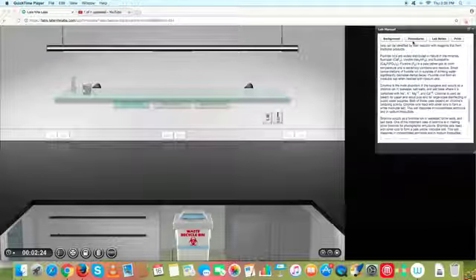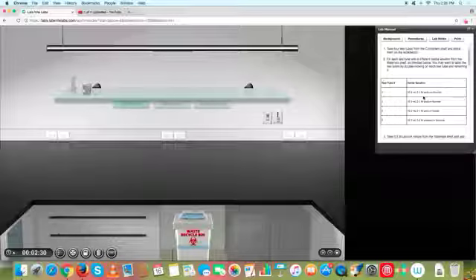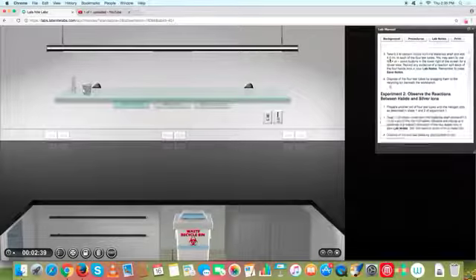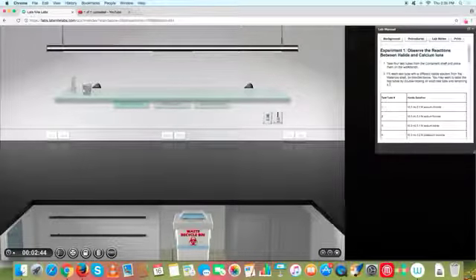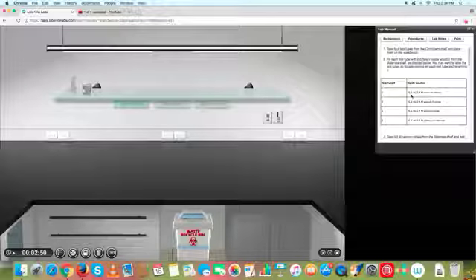Alright, so that's the background, now the procedure. It's not particularly difficult. All you need to do is follow the instructions set forth in the lab, and it works out pretty well. I'm just going to do the first part of the experiment, and then you can do the rest of it yourselves. Make sure that any results you write down are written into your lab notes. Don't try and remember everything. You've got to write it down so you can write up your report.